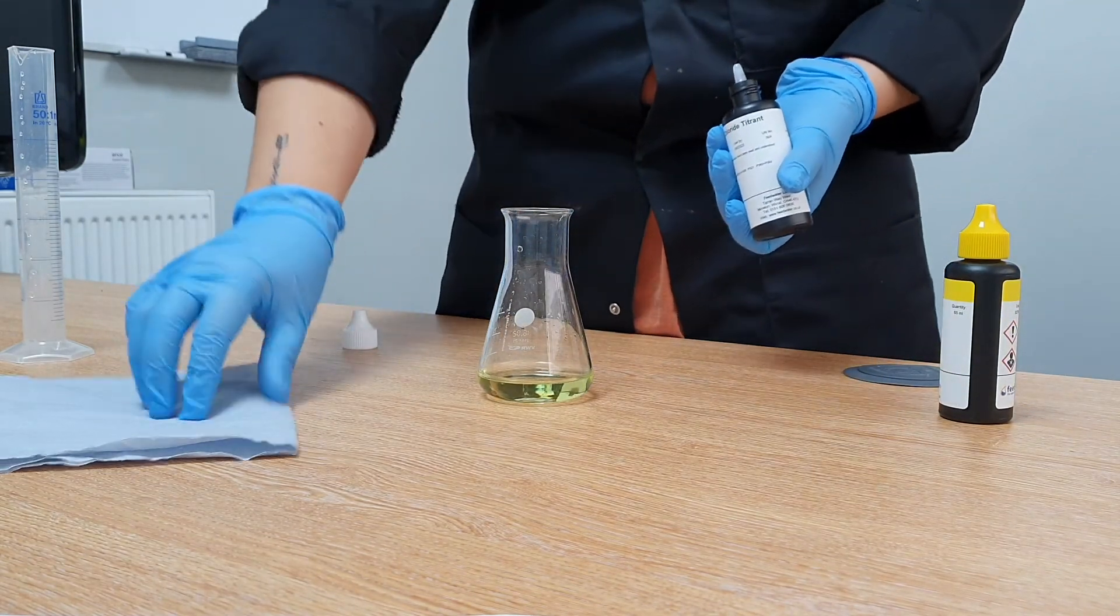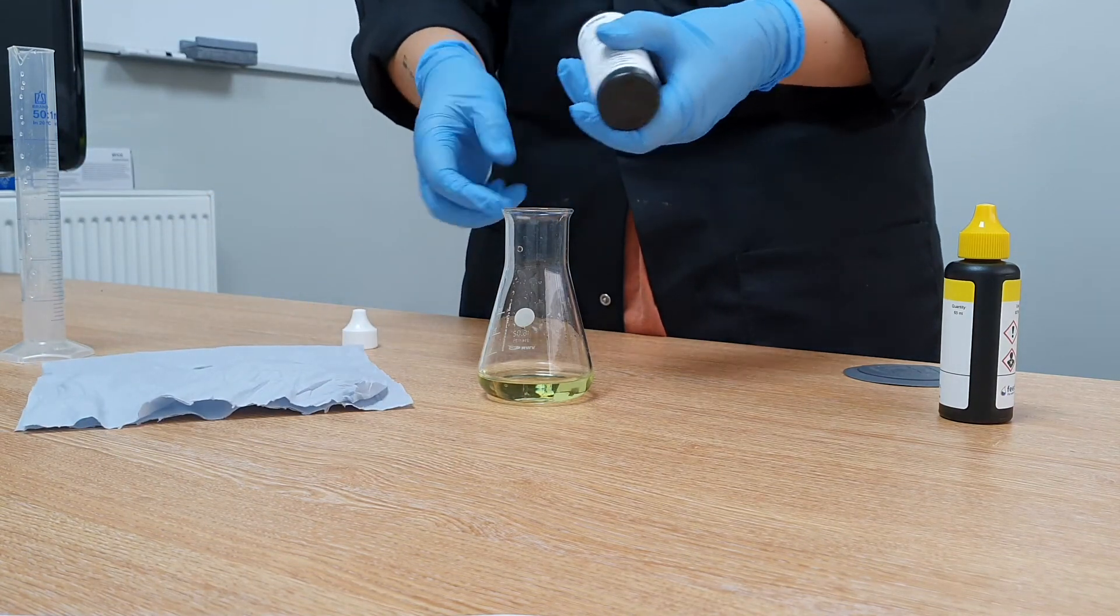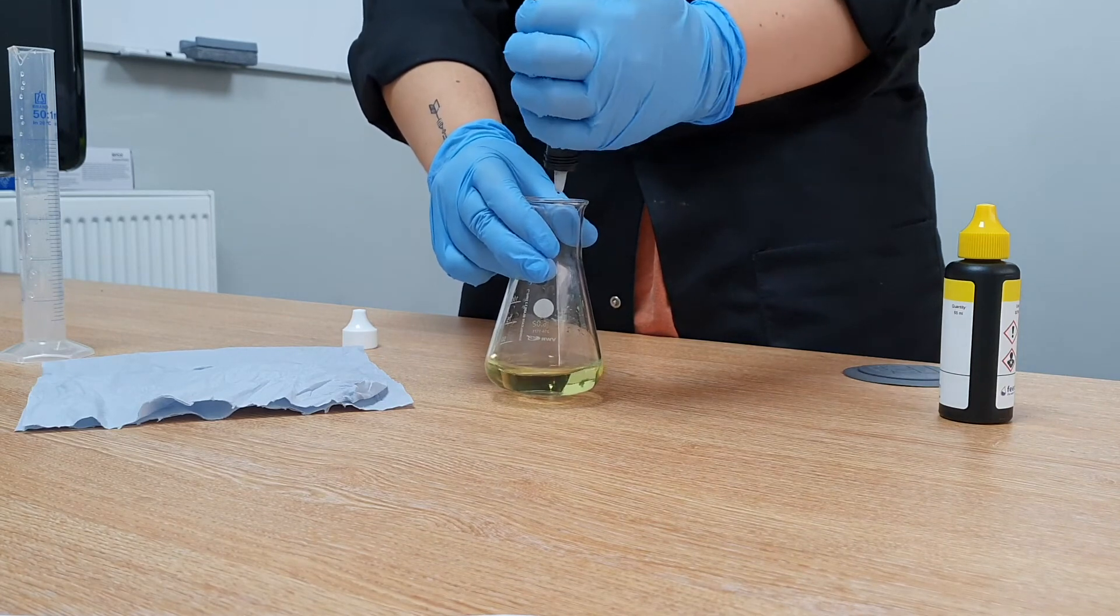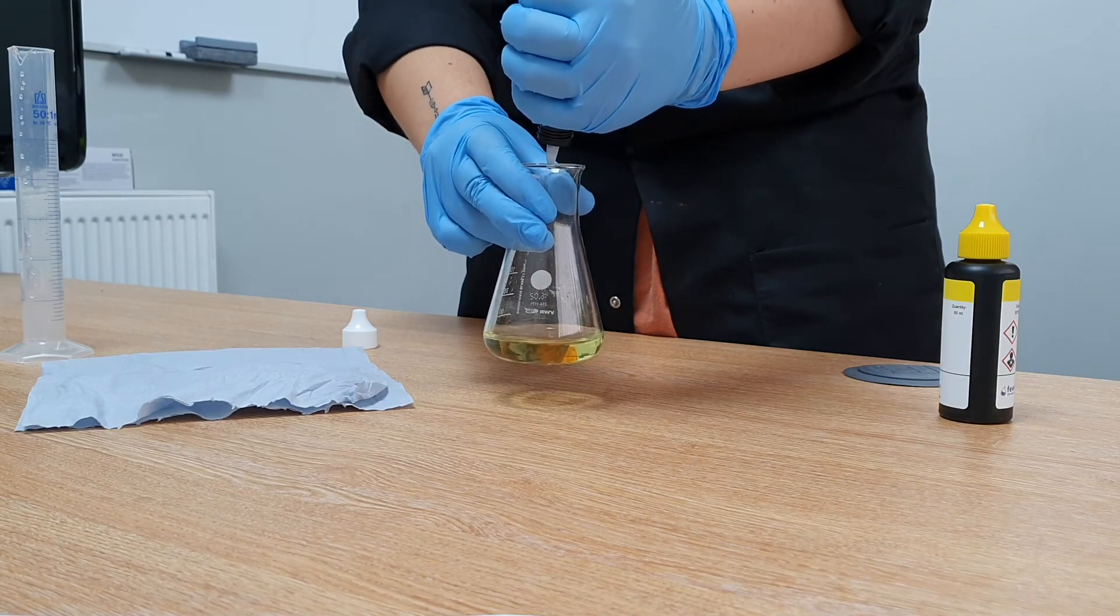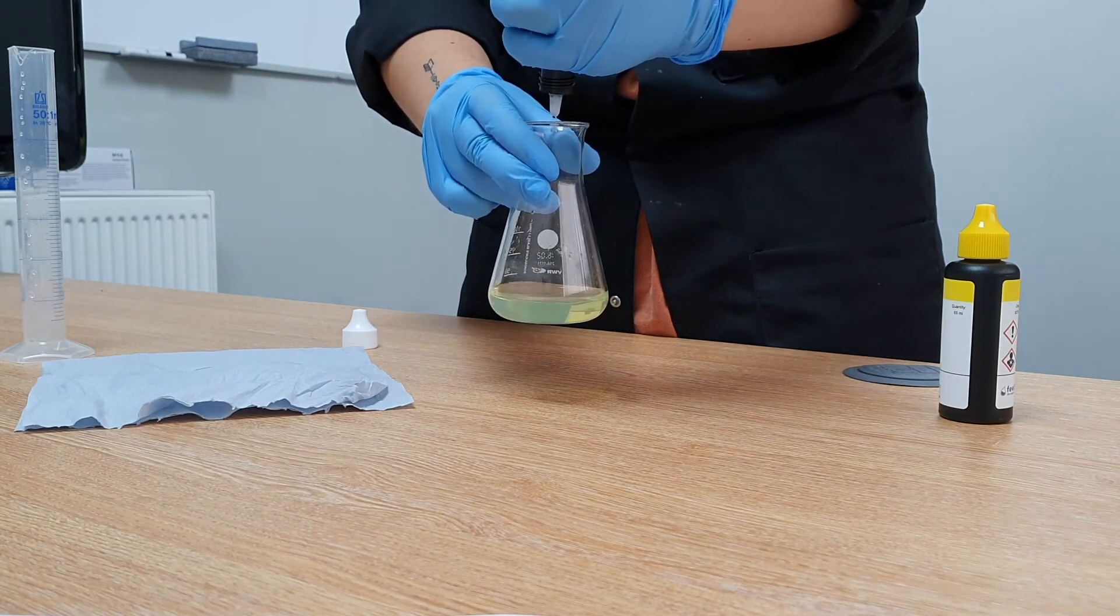Moisten and wipe the tip of the chloride titrant dropper to ensure it is clean and then add it one drop at a time to the sample counting the number of drops until the colour changes yellow to the first orange or red colouration visible.